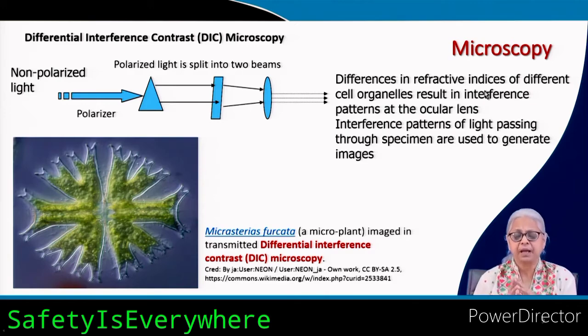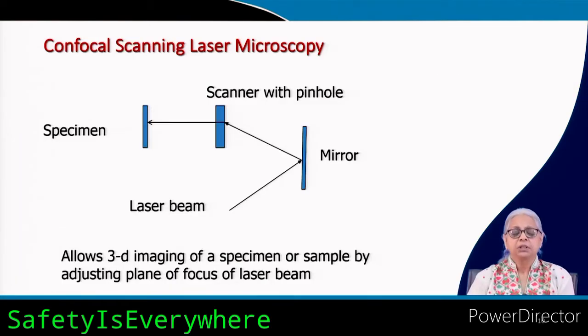These interference patterns of light will be used to generate these images, and this is one of the outcomes. So this is a microplant cell.